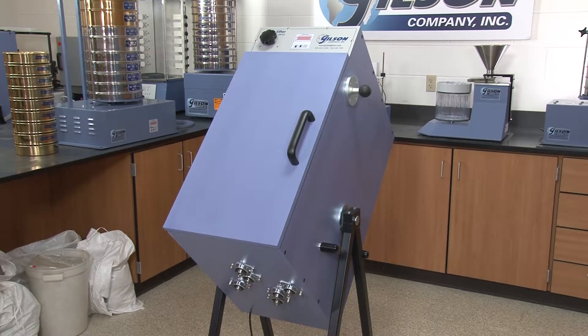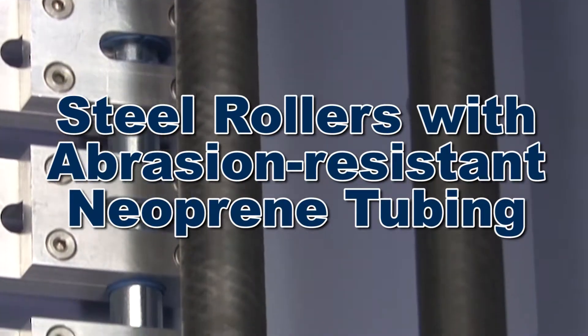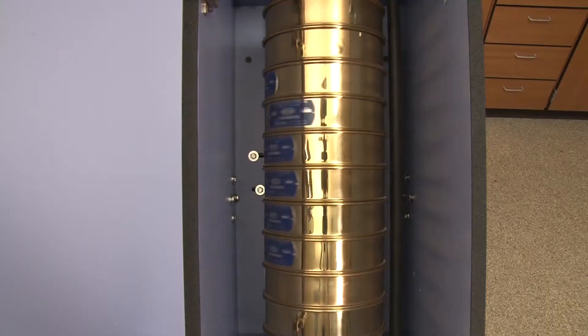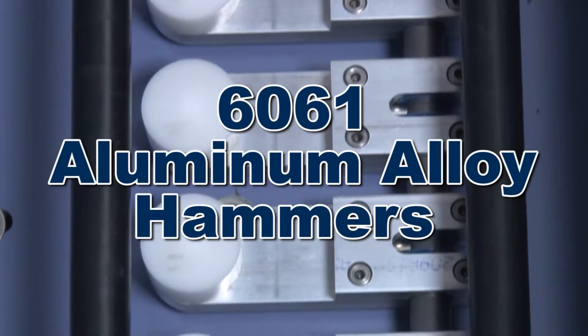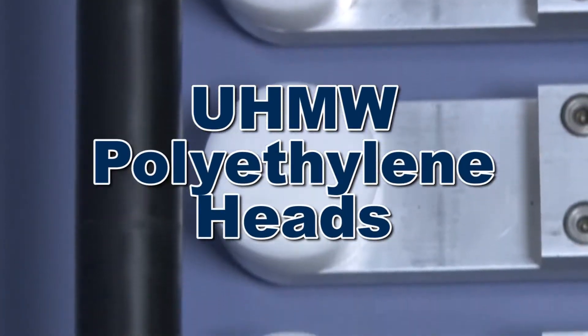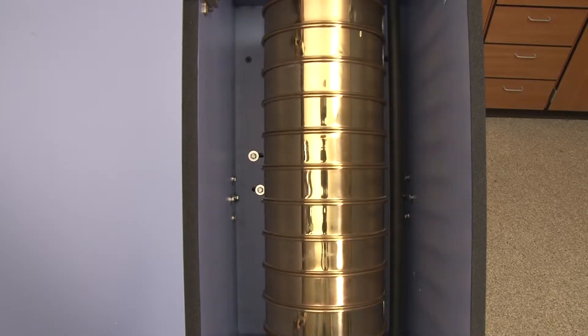Driven by a dependable quarter horsepower motor, steel rotors with abrasion-resistant neoprene tubing rotate the sieve stack, while tapping hammers made of durable 6061 aluminum alloy and ultra-high molecular weight polyethylene heads result in repeatable and accurate sieve analysis.